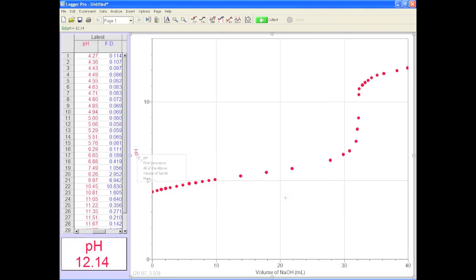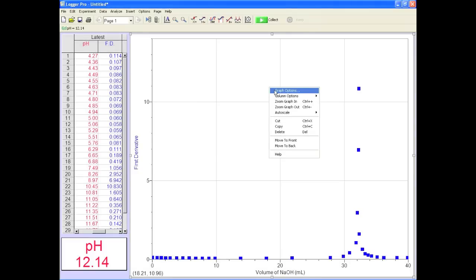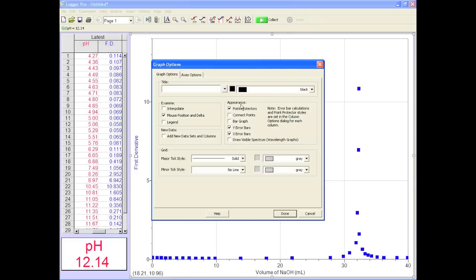To see the new curve, click on pH on the y axis and select first derivative. There it is. Join those points together by selecting connect points in graph options.